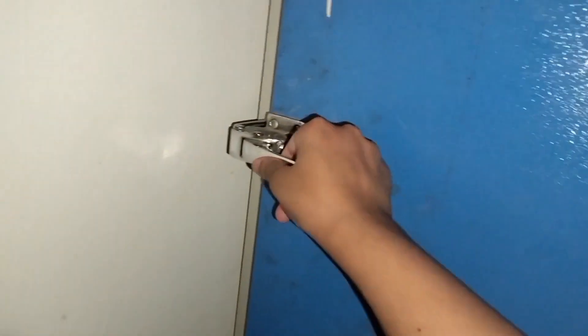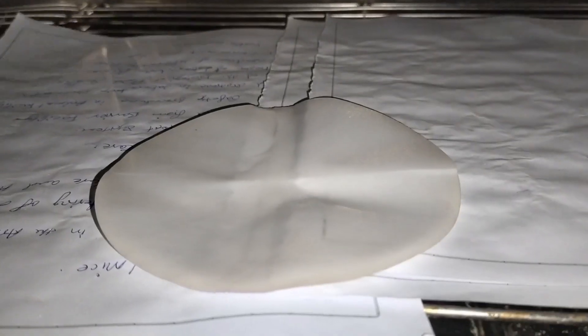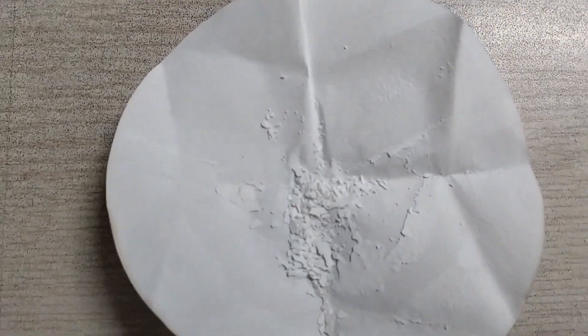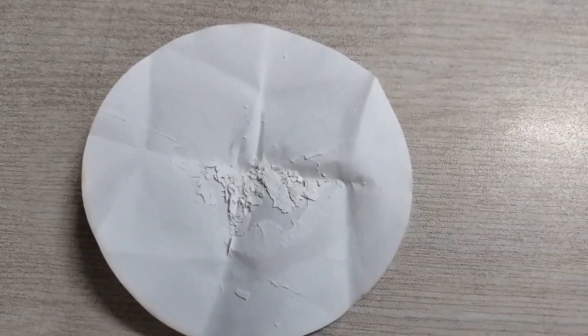The obtained micro sponges are put into the oven for drying for 12 hours at 40 degrees Celsius. After 12 hours, the micro sponges are completely dried and prepared, and here are the micro sponges.